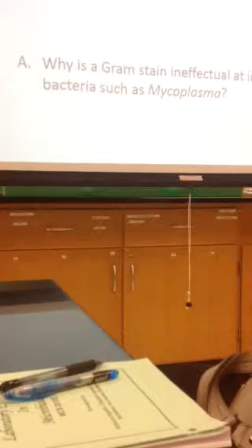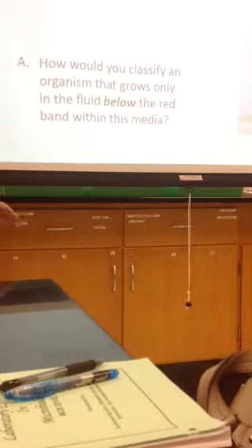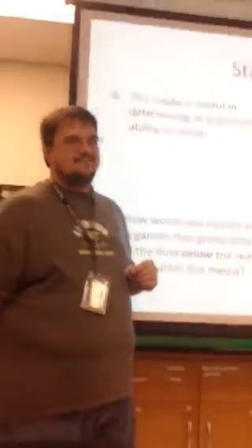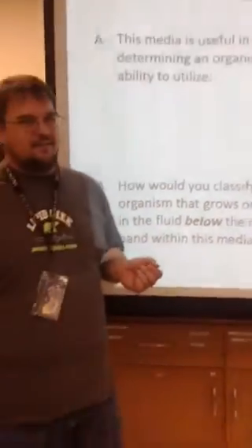Alright, you guys with me? Alright. So, this media right here would be used for what? I know it's a different color, it got a bad transfer. Usually for us, it's green at the top. Y'all remember that one? So what is it used to identify? Y'all don't remember that green tube? That was TGB.